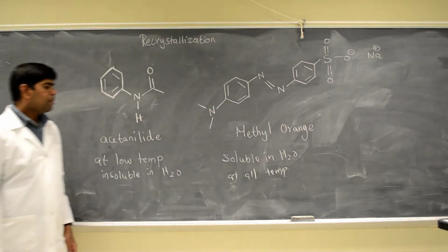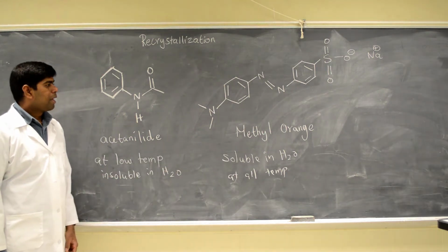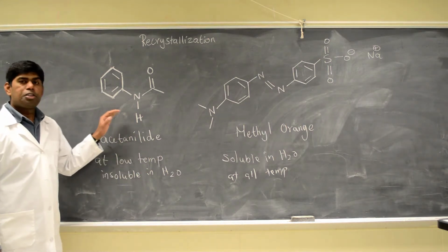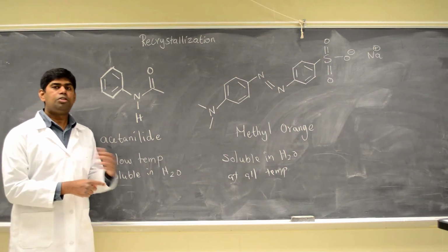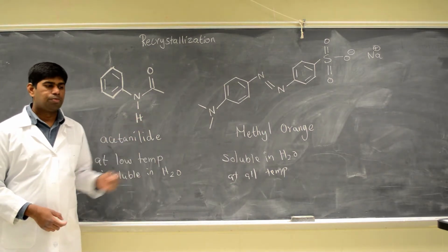Right. So we use the hot water to dissolve both, and then we cool down the solution to selectively crystallize out the insoluble acetanilide, and then we do a filtration to separate the crystals from the solution.